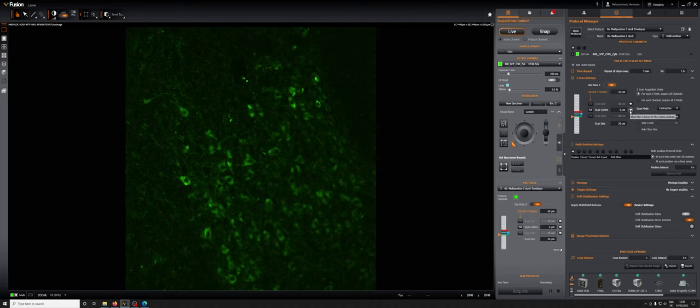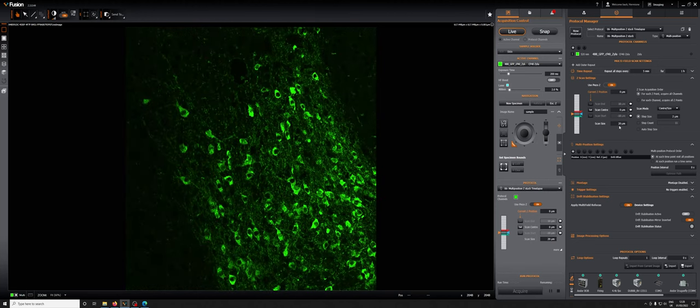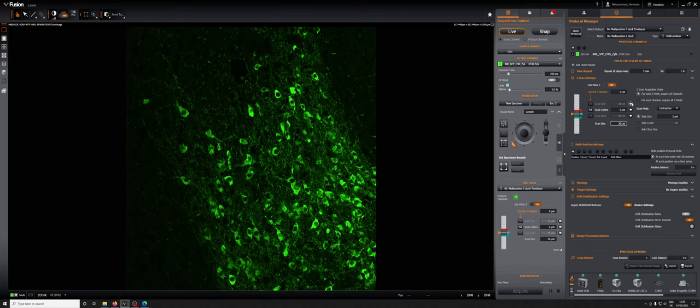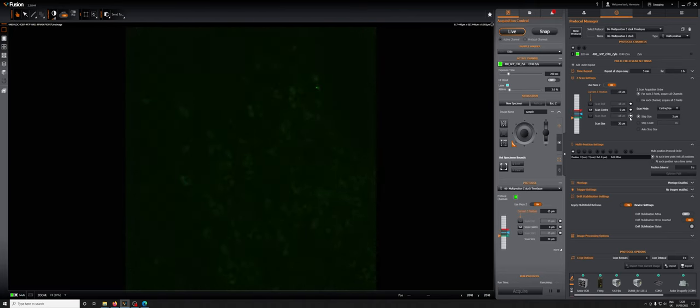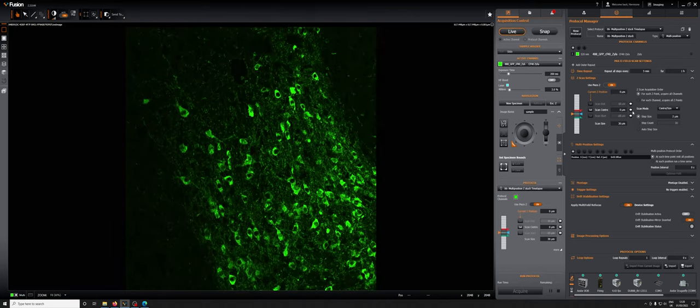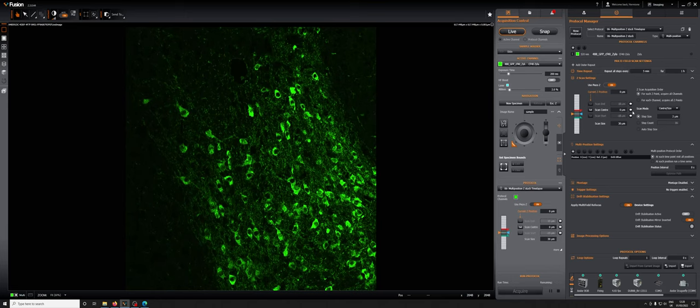As a result, I'm going to say, well actually I want to increase my scan size to maybe 30 microns. So now if I go above and below, you can see that I'm capturing more, I'm not missing anything. This is a good test to do particularly on the first point.